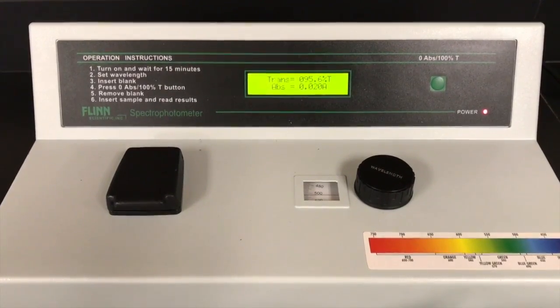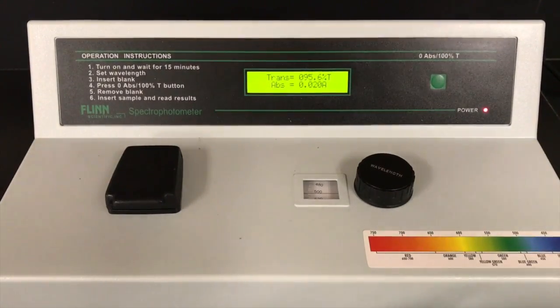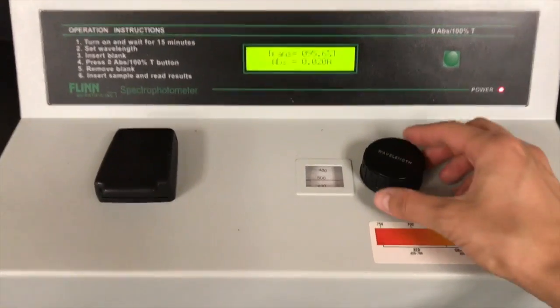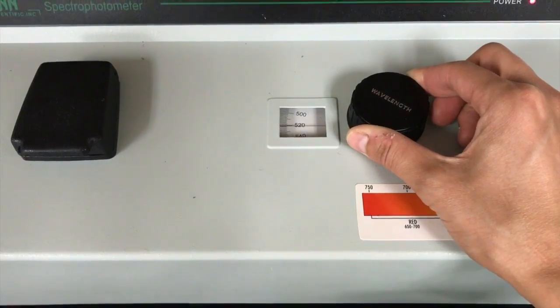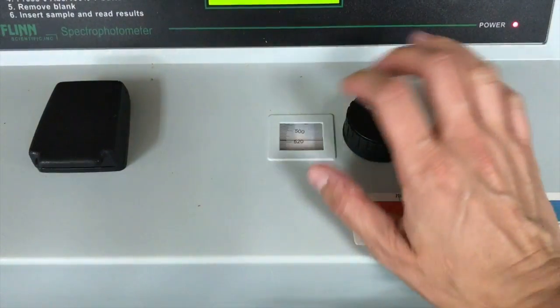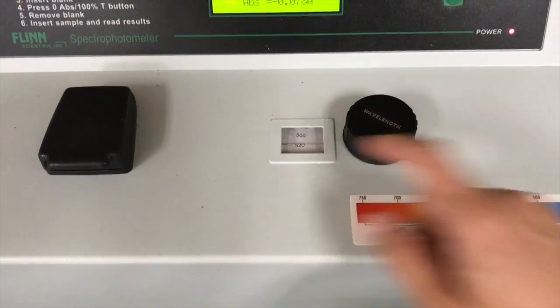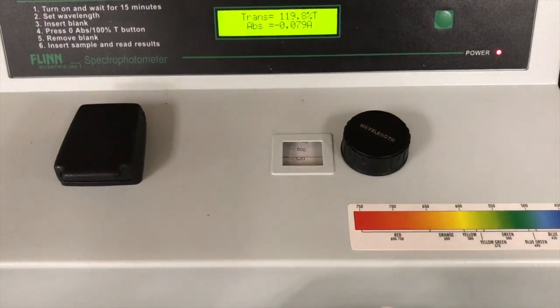Now, one thing that I didn't mention: before you use your spectrophotometer at all, one of the instructions in your pre-lab was to determine the proper wavelength. So if you notice right here, this says wavelength, you can adjust to the correct wavelength, whatever you decide. Once you adjust it at the very beginning, before I did anything, you need to have that set, and then you're going to leave it alone. You're not going to use that anymore, all right?